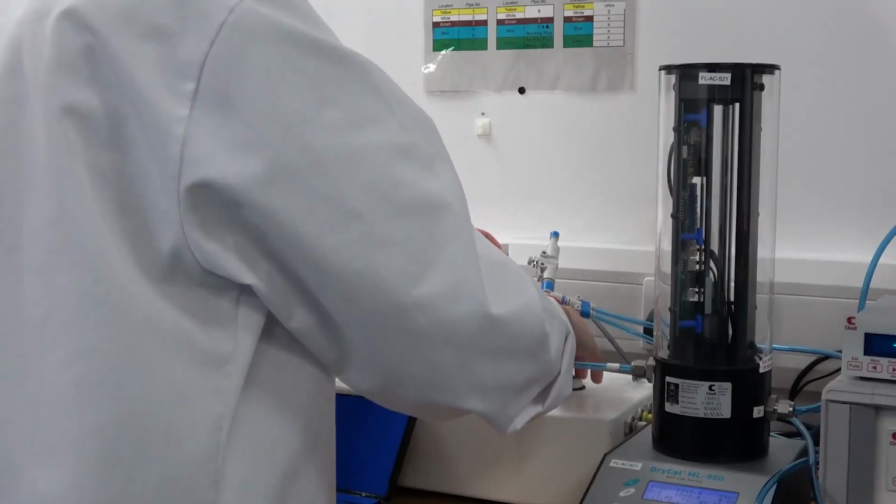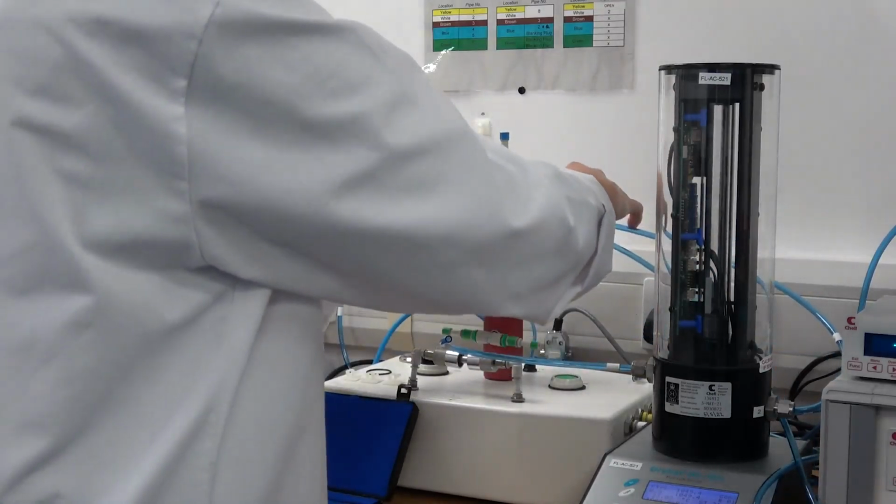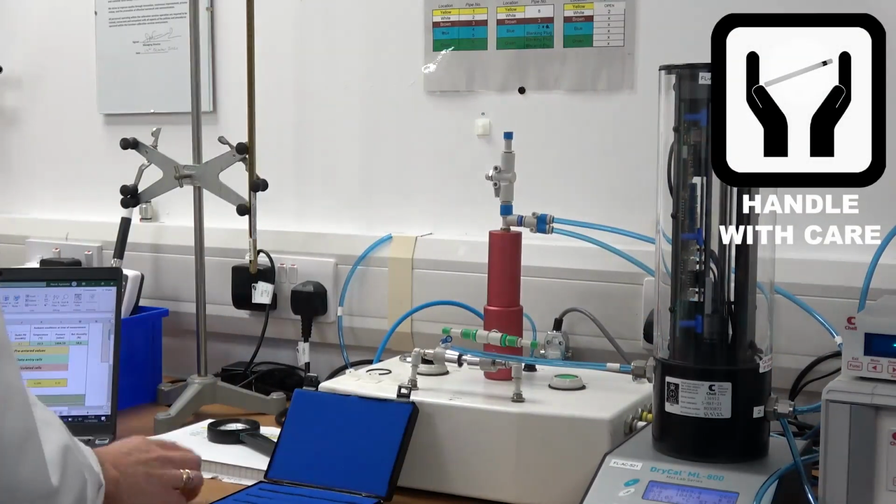The standards are multi-capillary standards manufactured from glass. These have 10 fine capillaries encapsulated in a glass rod. Standards are available from 50 mm water gauge. PD calibration standards, being made of glass, are susceptible to damage by careless handling.